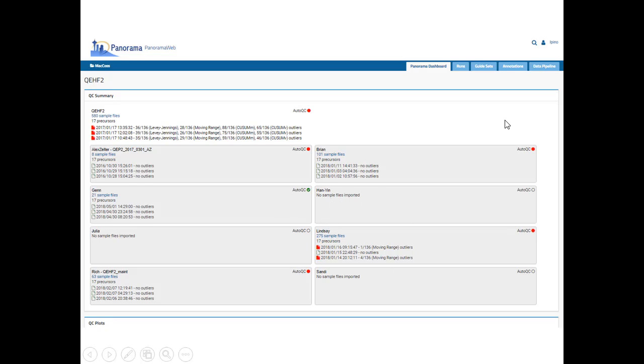Nobody at the time was running AutoQC. So whoever was on, shame on them. They should have been running AutoQC. Oh, no, Jen was running AutoQC, sorry. The green circle on AutoQC shows that it was currently running at the time. So of the other users, 3 had never run AutoQC on this particular instrument.